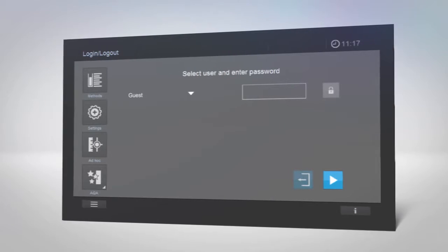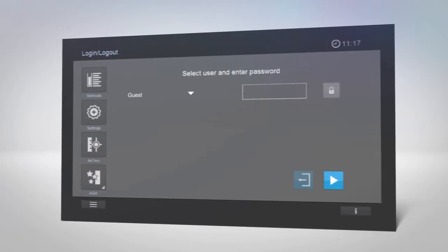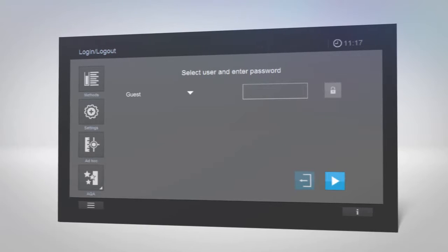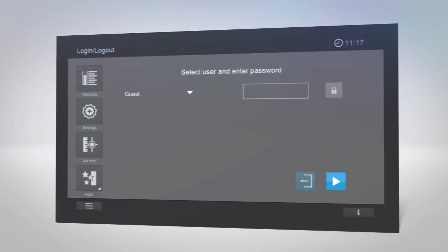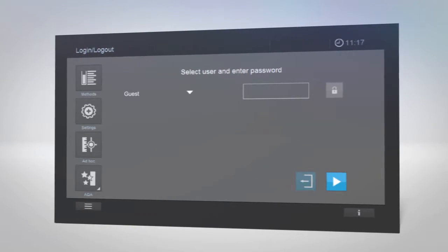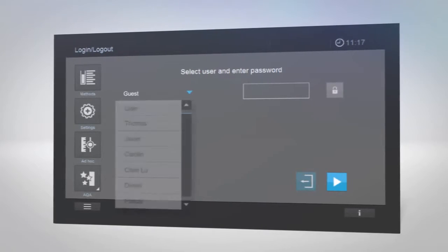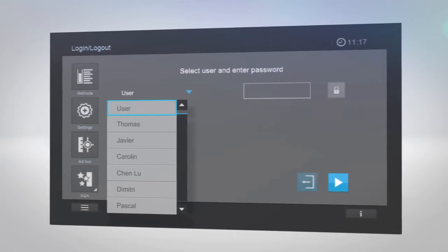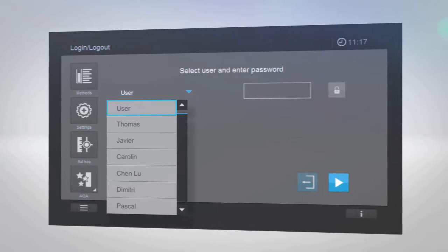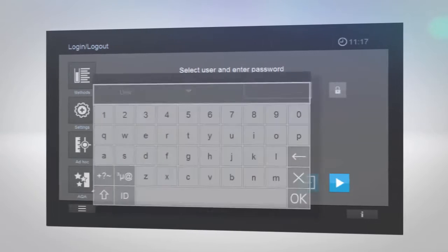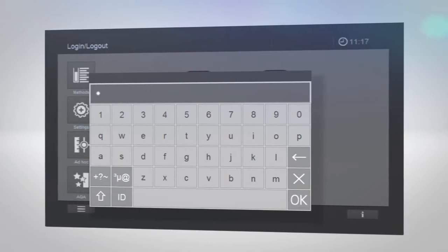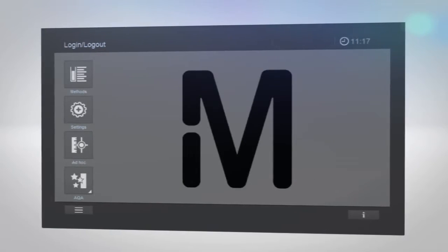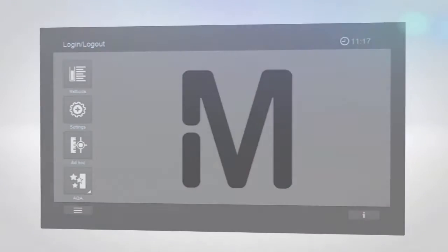Next, if the user management is activated, you must log in by entering your user ID, creating a new account, or signing in as a guest. Tap the drop-down menu and select the account you wish to use. Depending on your account, you may have limited functions. After logging in, you will be ready to start measuring.